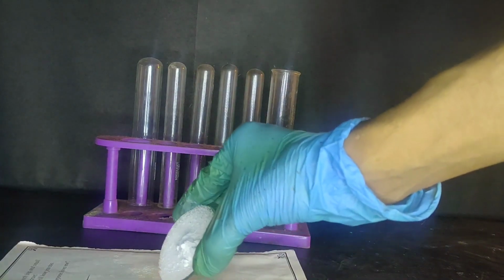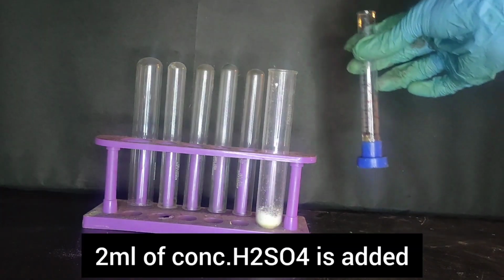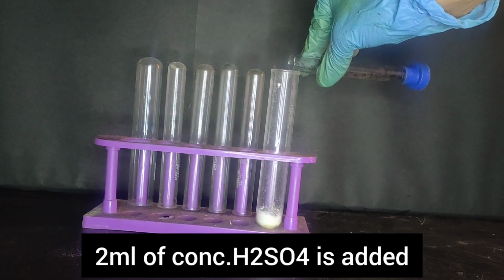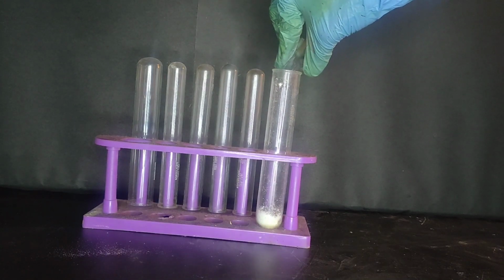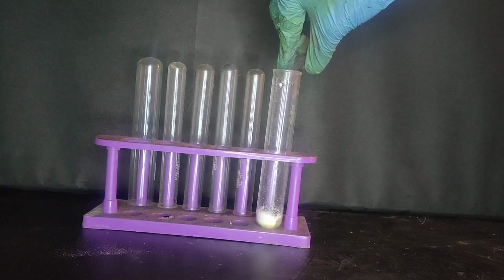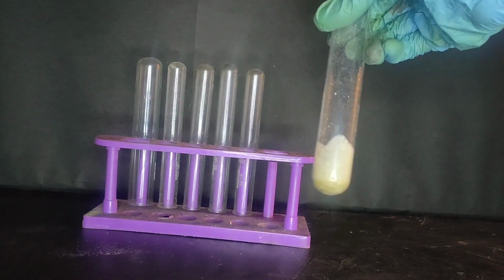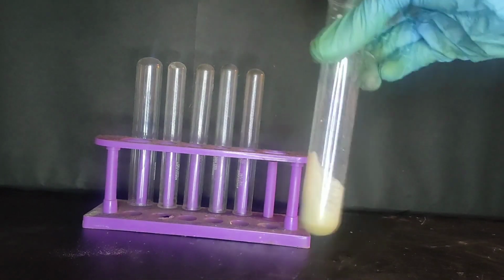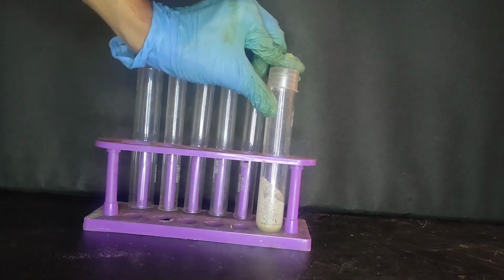This is transferred by means of a paper to the naphthalene. 2 ml of concentrated sulfuric acid is added, and the contents are thoroughly mixed together. Then the test tube is stoppered.